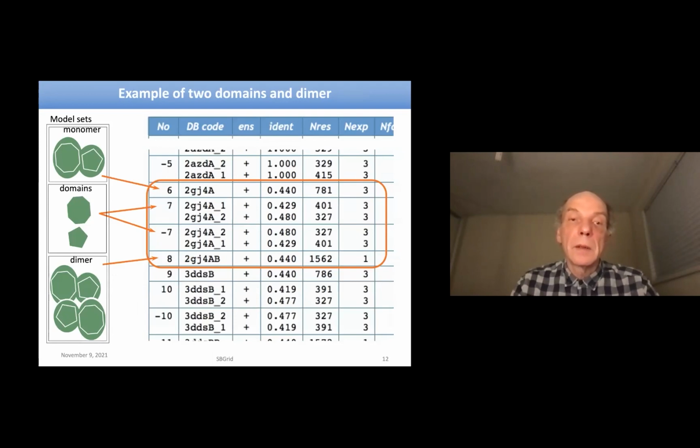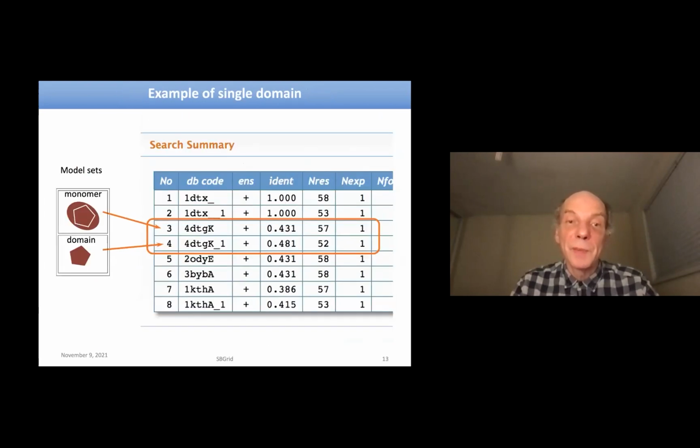And that's yet another example where we've got one PDB producing 4 different models, and actually we've got 2 models denoted by positive and negative numbers. It's just with swapped order. That only happens with the top 2 domains in size. But normally the search is completed with the bigger domain being used first, and I will explain later why. Well, it's obvious, but what it also implies in the molecular replacement.